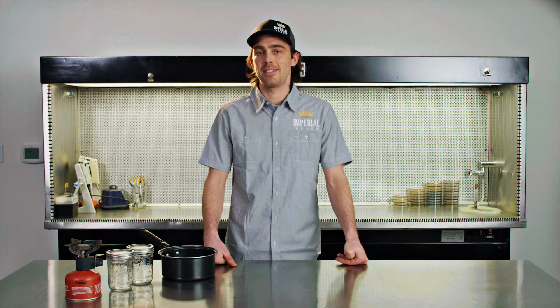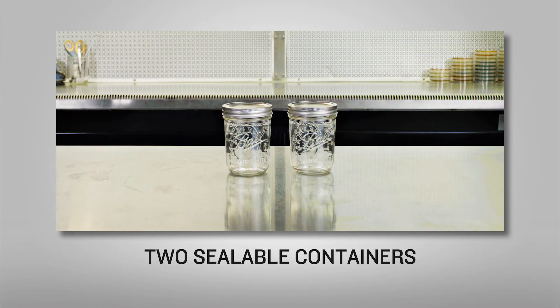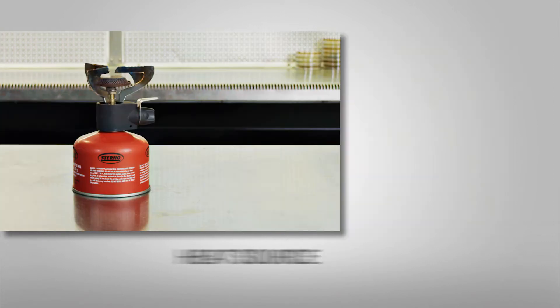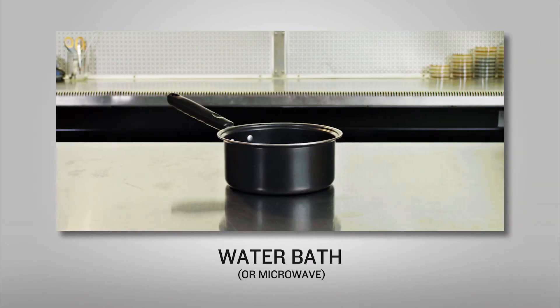To perform this test, we will need two canning jars, glasses, or other containers that have a lid and can be sealed, a heat source, and ideally a water bath — although if not, you can use a microwave.